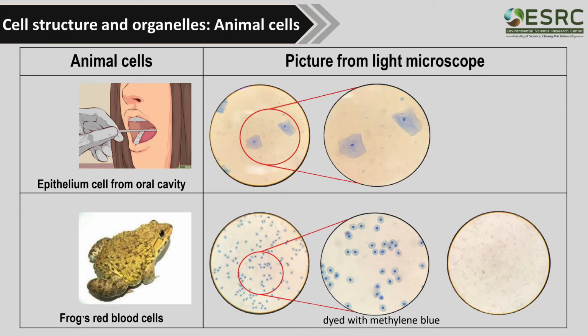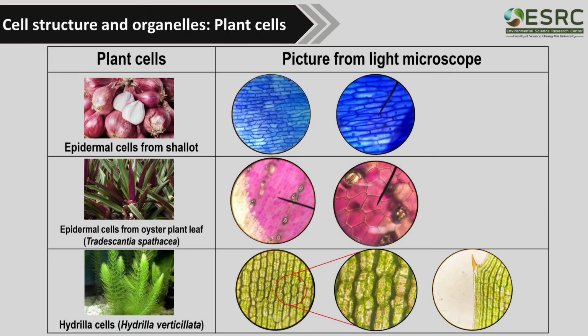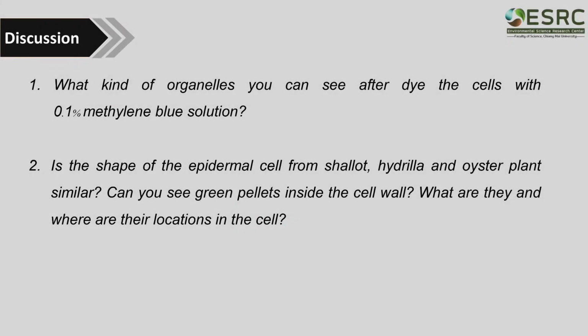These are what we observe. Students may pause this video and draw pictures of cells in your report. Please label the organelles you draw. After the students observed the pictures of cells, let's discuss these questions.